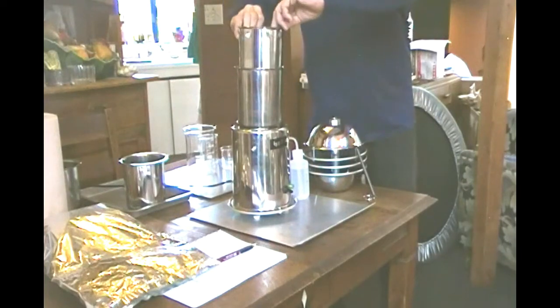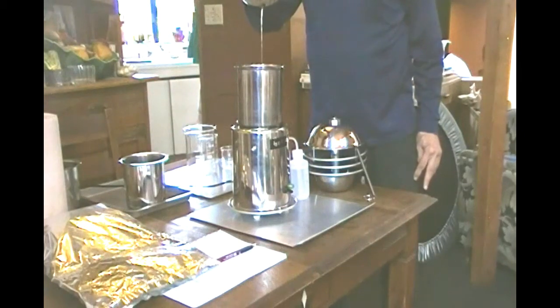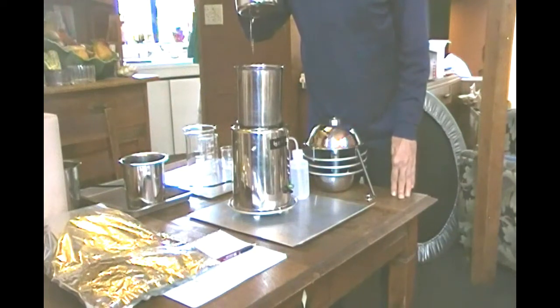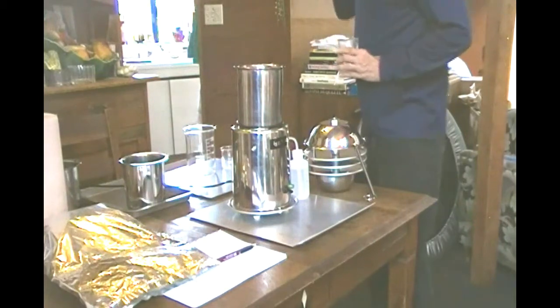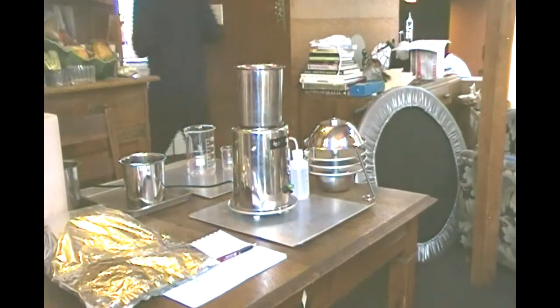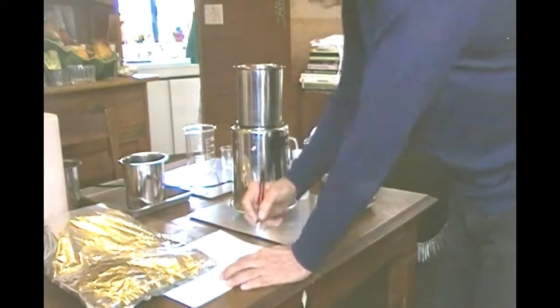Now, we lift this up, and as you see, there it is coming out. It's already turned a little bit of a color, and it looks like we're going to have our inch or so in the bottom of the processing vessel from this amount of alcohol. Actually, it's going to add another 50 milliliters of alcohol. So I'll take my beaker, get my alcohol, go away from the operation, and we add another 50. And we write this down.